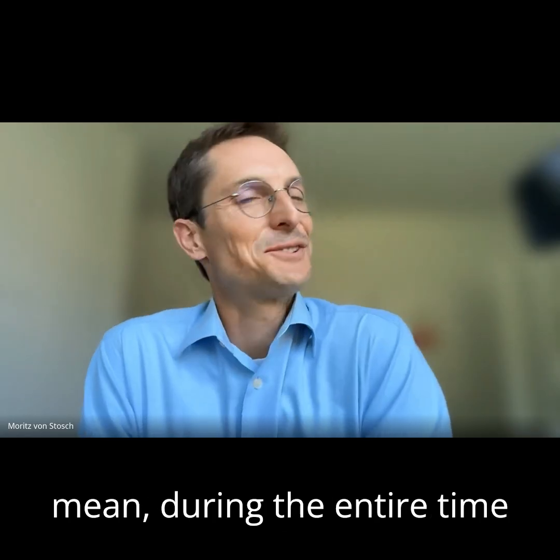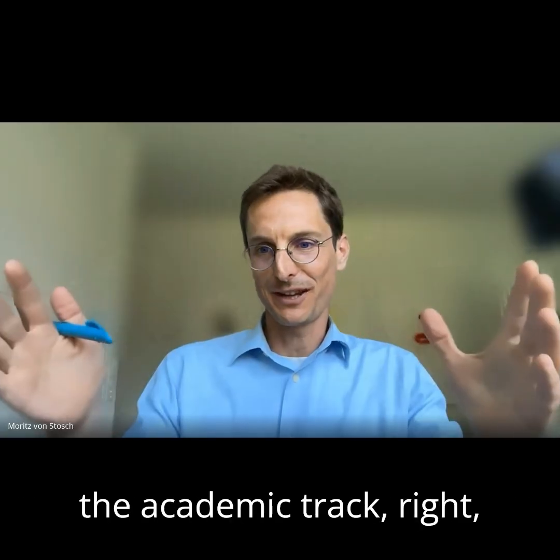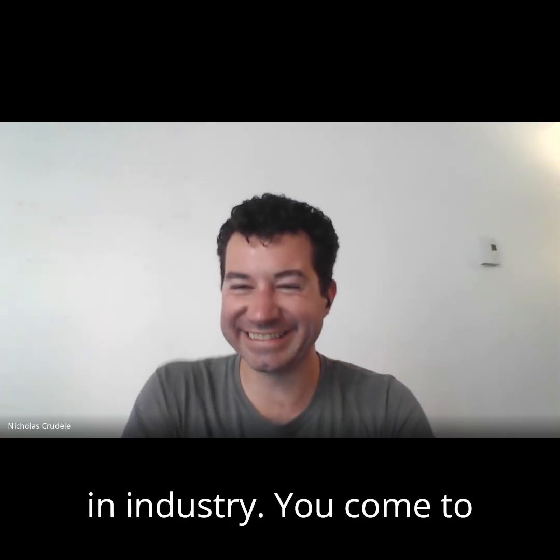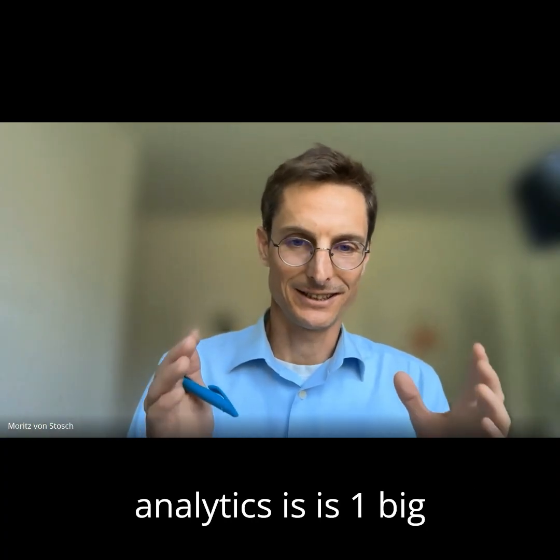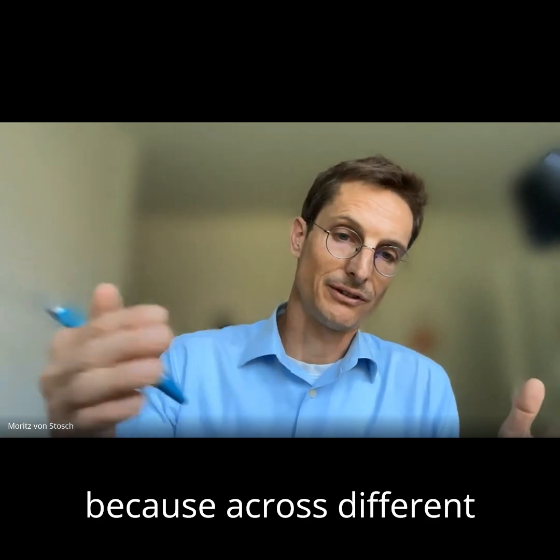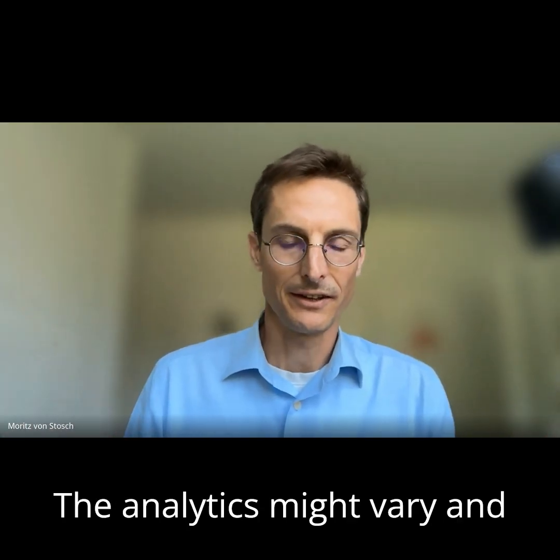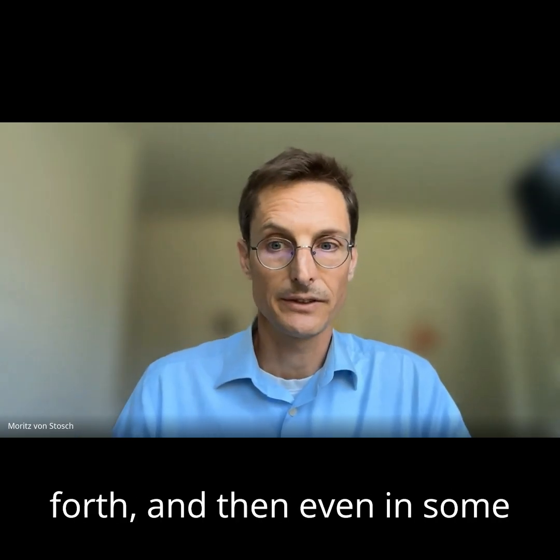During the entire time in industry, one thing when you come out of the academic track is that you cannot imagine the challenges that are present in industry. And then you come to industry and you understand for the first time what the challenges really are. And analytics is one big challenge. Why is that? Just because across different projects, the analytics might vary. Across different companies, of course, the analytics vary. Across sites, the analytics might vary. You have different calibration standards and so forth. And then even in different instruments.